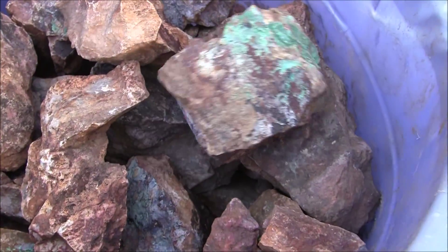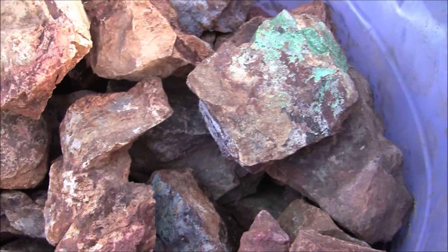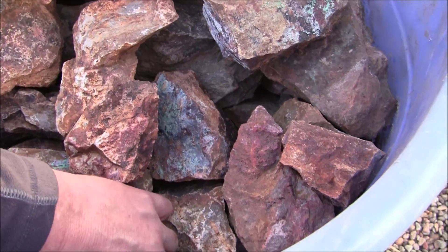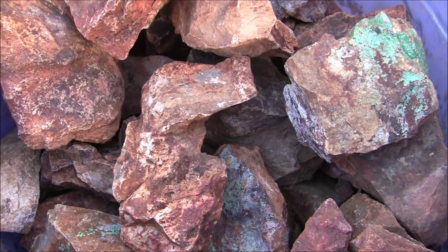I'm going to run some of it on a wave table — I have an RP4 shaker table. I'm going to do some chemical testing on some of it. And I'm going to do a torch assay. I'm going to post these videos on YouTube.